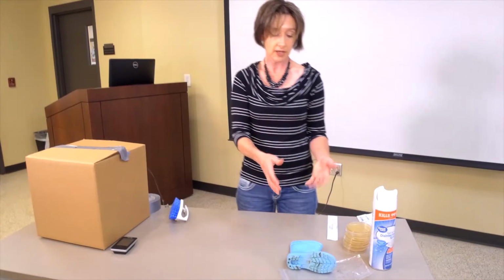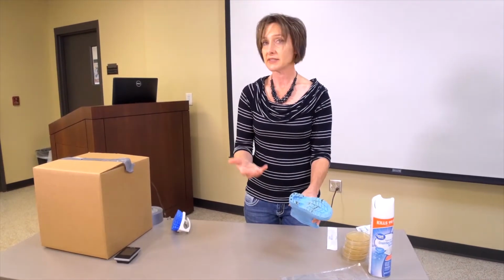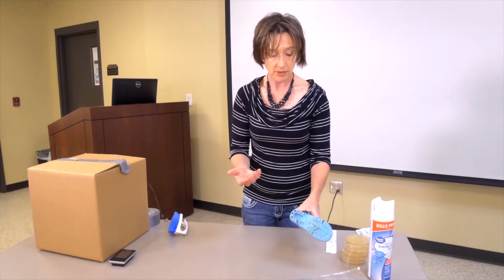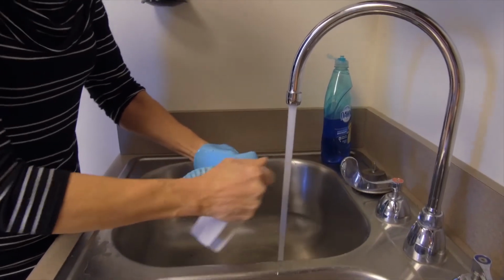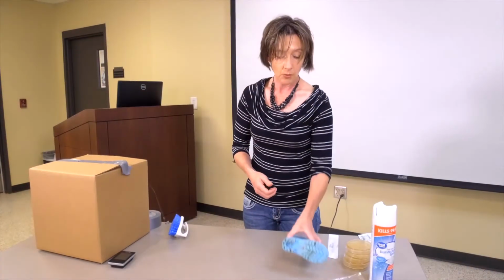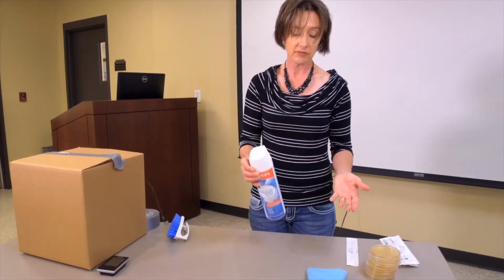We're going to plate a boot that is essentially a boot that we might think is acceptable to go into the house, but maybe isn't actually cleaned properly. We're going to plate a boot that has been just scrubbed with some soap. We're also going to plate a boot that has been just applied with disinfectant.